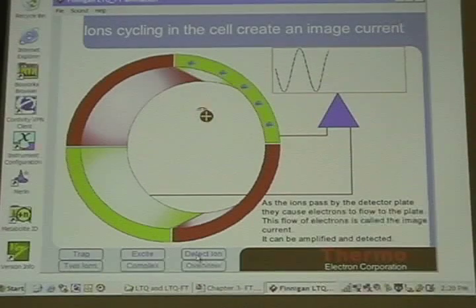Is it linear with that AGC value? No. It hits a limit. Gigi was operating up at 66, 6 million ions, with a short IT. Even with a long IT, it wasn't linear. The problem is when your IT time gets really large to handle these large populations, when the ions come in, some of the ions pop back out. If you're having this ICR cell open for a second and a half, you start to lose them back out. I find 1 to 3 E6 is probably your upper limit.